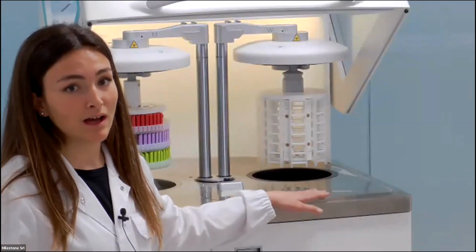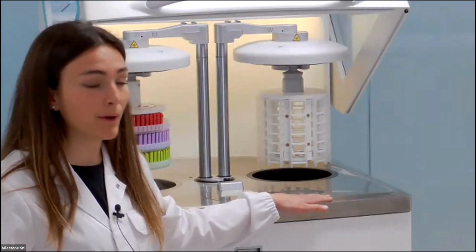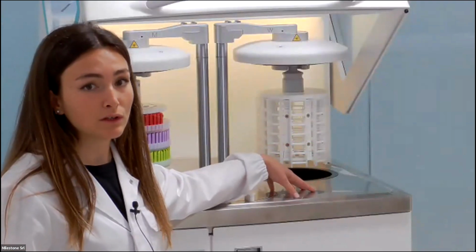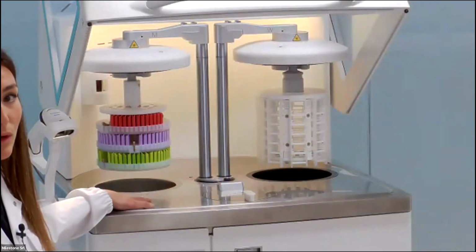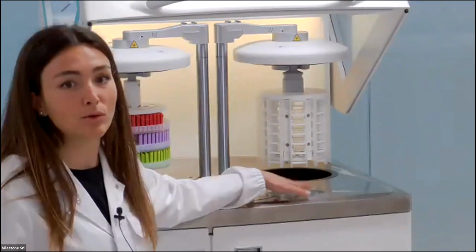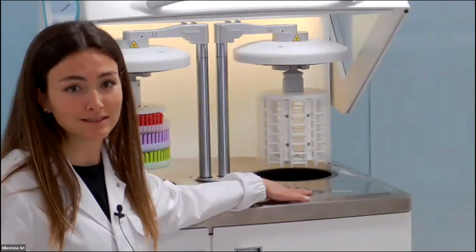So I have a dedicated cavity for the wax impregnation step with already melted wax inside. So it's not necessary to move the wax, because I have a cavity with the wax already melted for the last step.